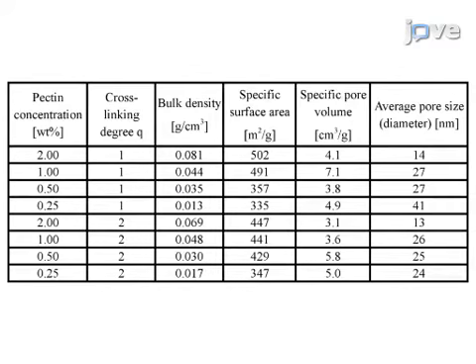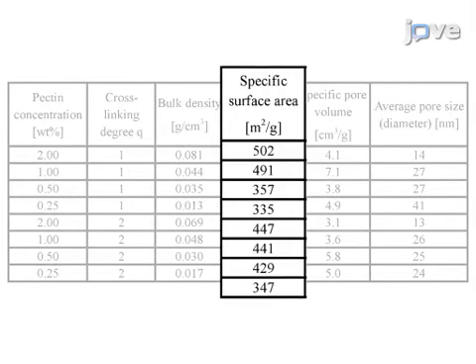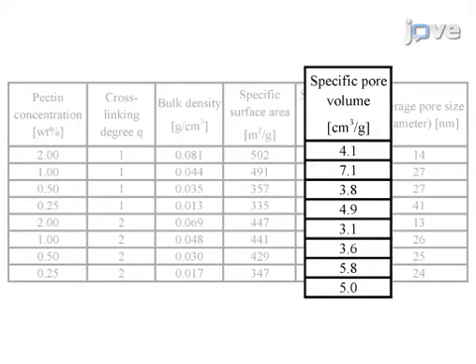The obtained aerogels were ultra-porous and had low densities. Their surface areas were measured by nitrogen adsorption. In the 4 to 150 nanometer pore size range, their volumes were measured by the Kelvin model of pore filling with nitrogen.